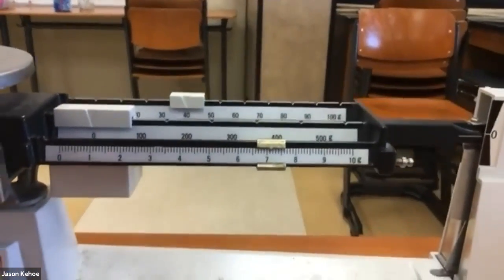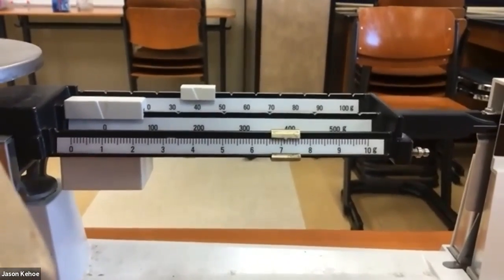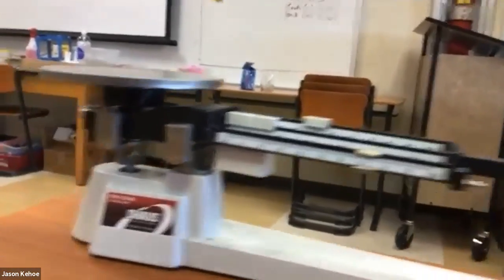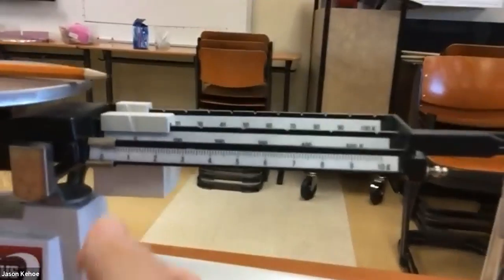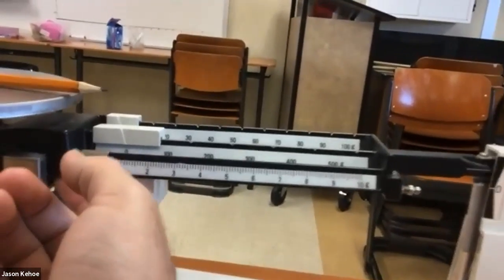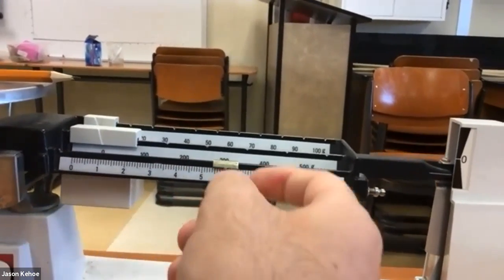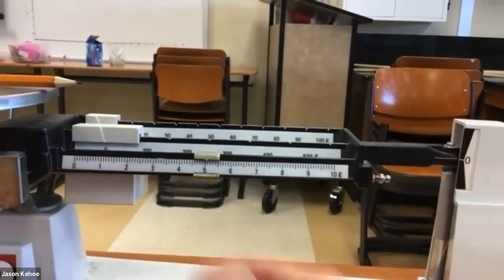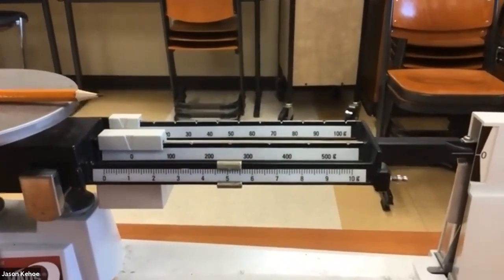And for our ruler, you can pause it here if you need to. Okay, resetting it to 0. Your pencil. I just knew that that was less than 10 grams, so I went straight for it.